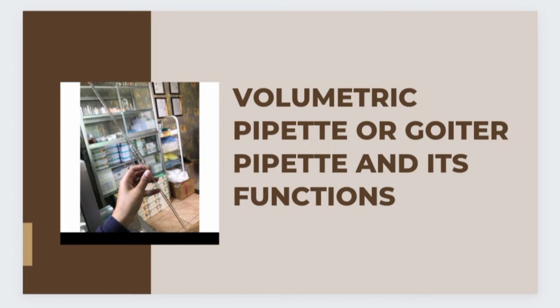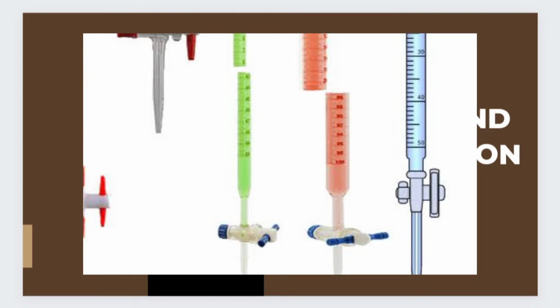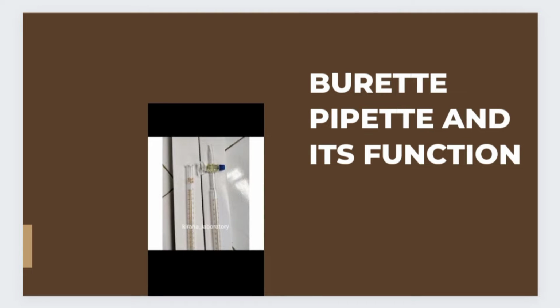The third kind of pipette is the burette. Burette is a laboratory instrument made of glass with a cylinder shape. This tool has measuring lines and a faucet plug at the bottom. This stopper is useful for keeping a certain amount of liquid reagent dripping in the experiment. Of course, utmost precision is required to ensure that the number of droplets is of the right size. This is what makes the shape of the burette quite unique.